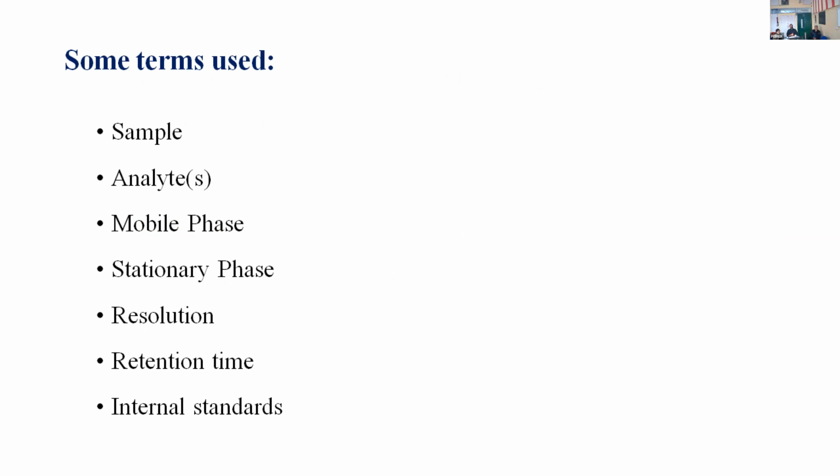So I will discuss some terms which are used further in the talk, and which are generally used during HPLC analysis. So sample. What is a sample?